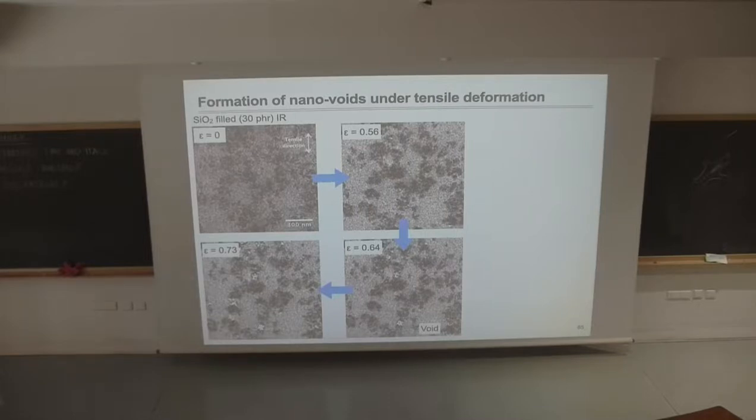And then, are you able to use this technique to construct a 3D structure? Yeah, you can. This holder is designed so that we can do this tilting. But surely, when you tilt, it is at a different strain. So it's a different time point. You need to construct from a single point when it's rotated, but the point moves. It depends on how big the field of view is. The gap is like a micron size, and your field of view is very small compared to that. So I think essentially I can assume that it's the same thing.